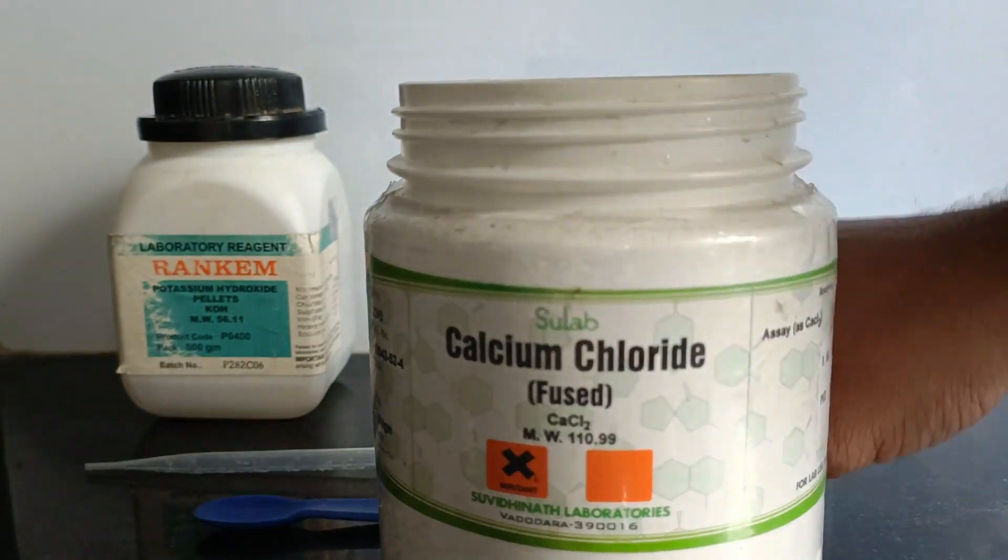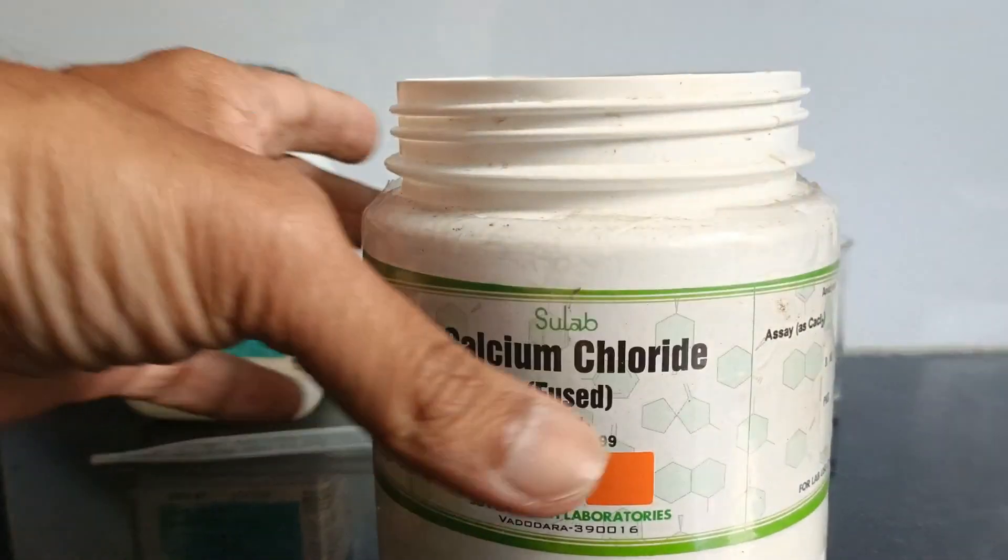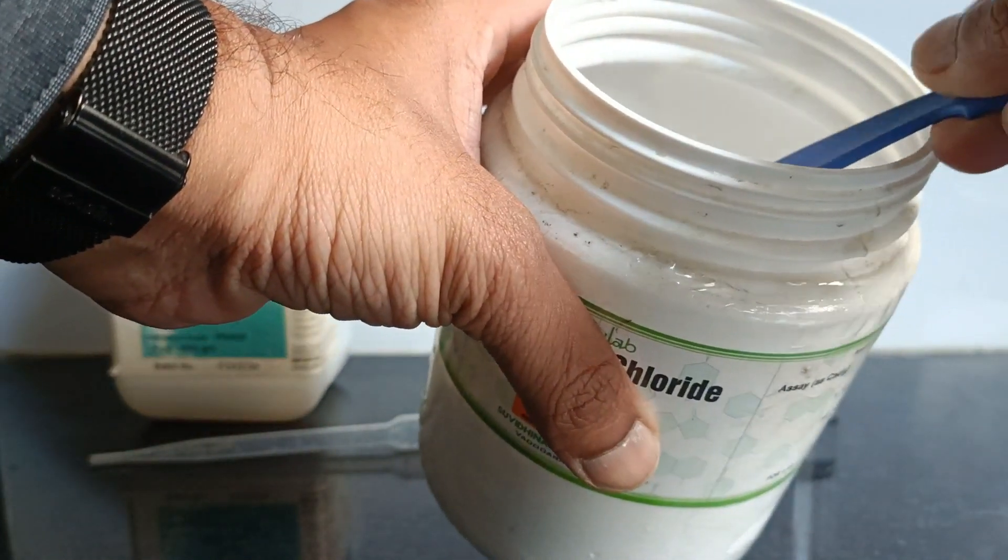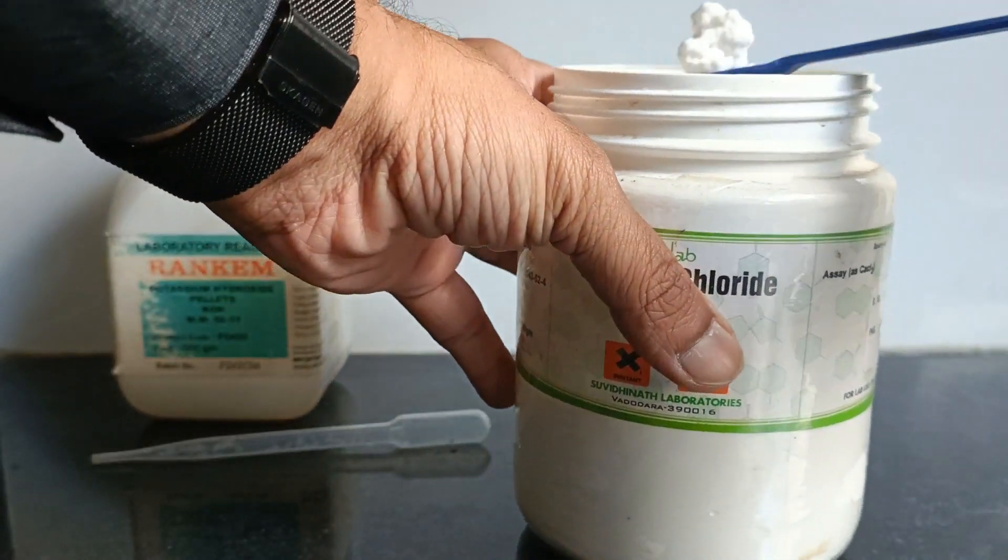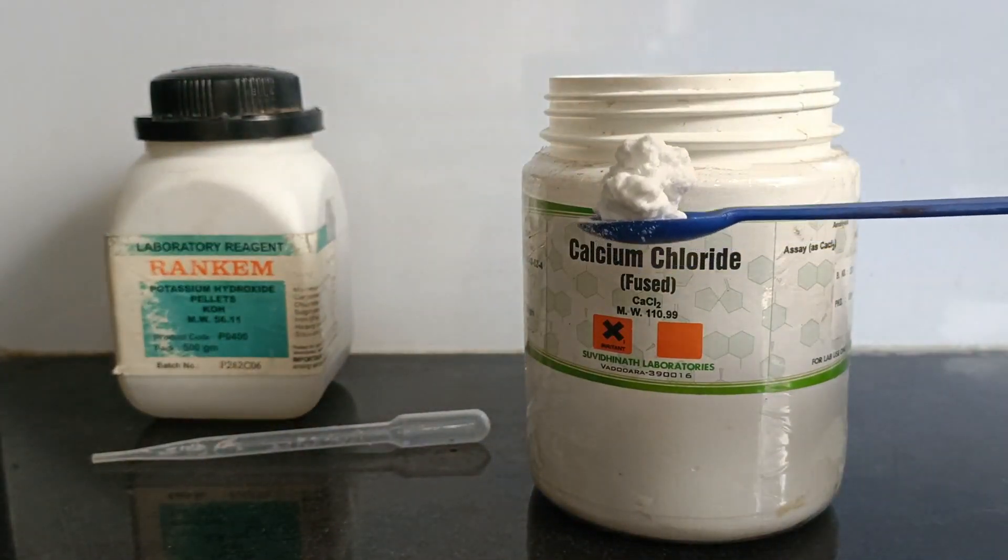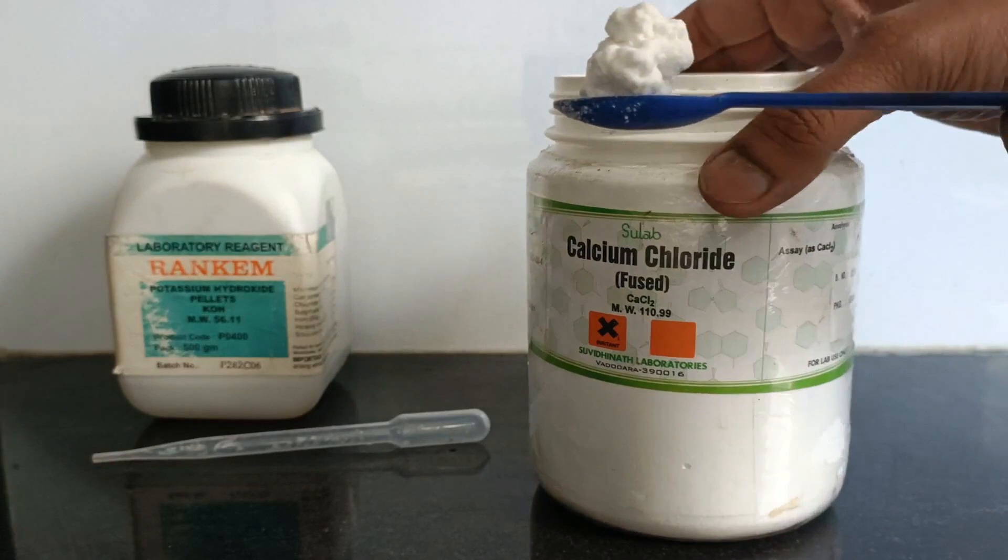This is written fused because it is anhydrous in nature, meaning no moisture content in it. I am going to take one piece of calcium chloride with the help of a spatula and add it into some water in a beaker.